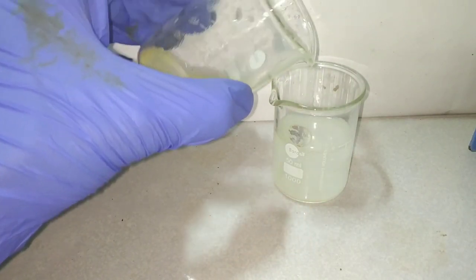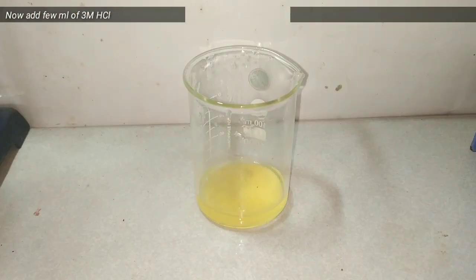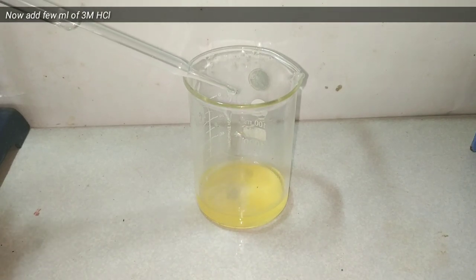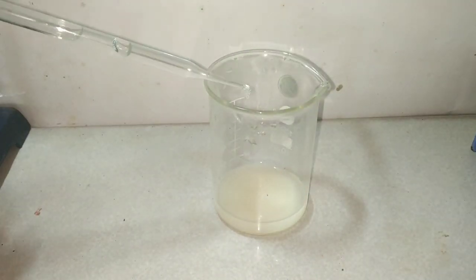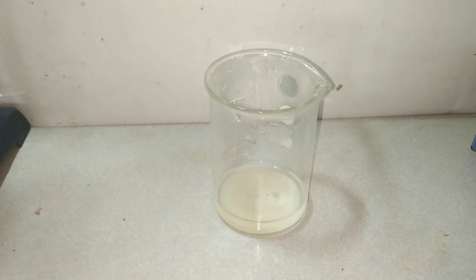Copper 1 chloride is not stable, so we will have to add some hydrochloric acid into the copper 1 oxide, and you can see that white color returning — that is the copper 1 chloride. We have to store the copper 1 chloride in hydrochloric acid. I have added some 3 molar hydrochloric acid here and we store it like that.